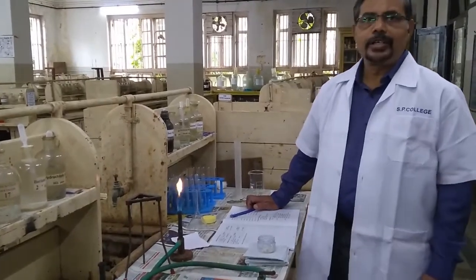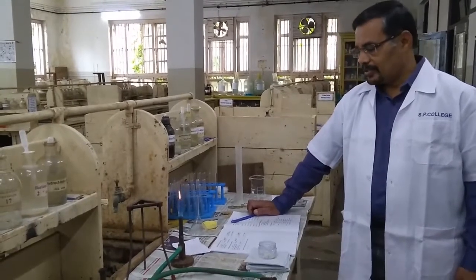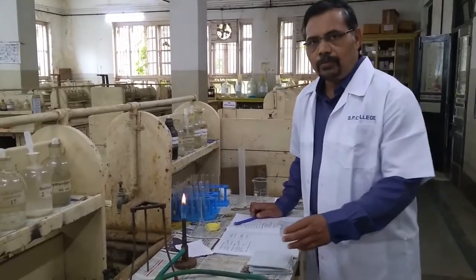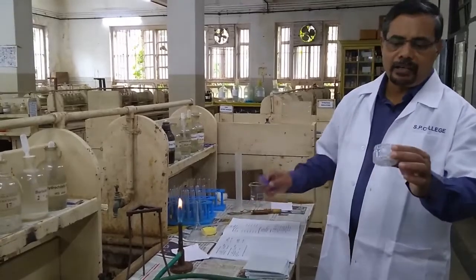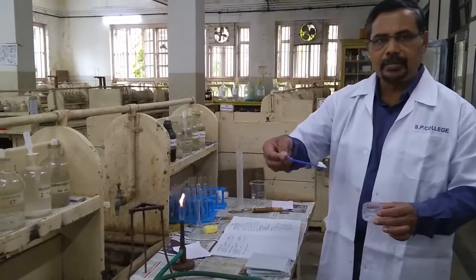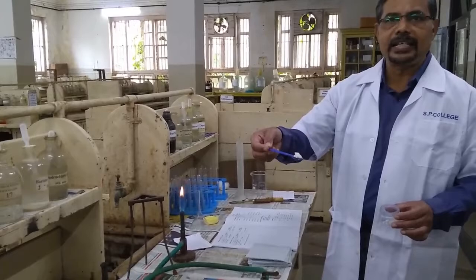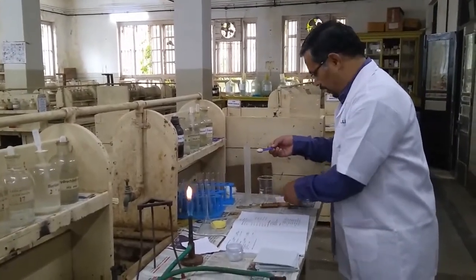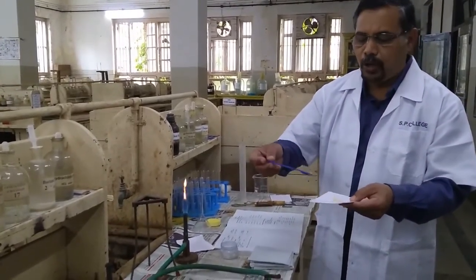Good morning, students. Today in the chemistry laboratory we will study analysis of basic radicals. For today's experiment, this basic radical mixture, that is a mixture of two salts, is given. This is a binary mixture of salts, two salts containing two basic radicals. So take this small quantity of given mixture on rough paper with the help of small spoon.